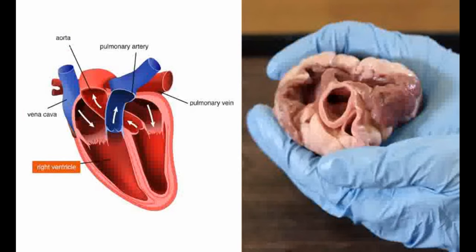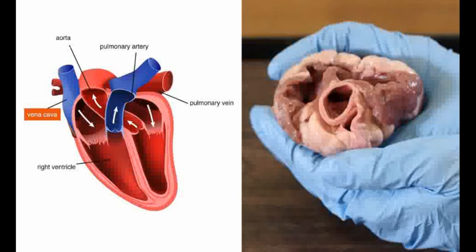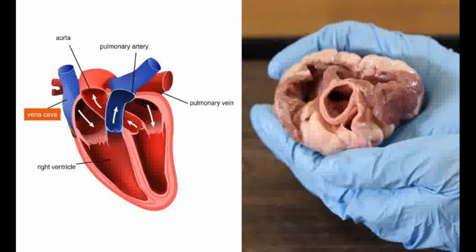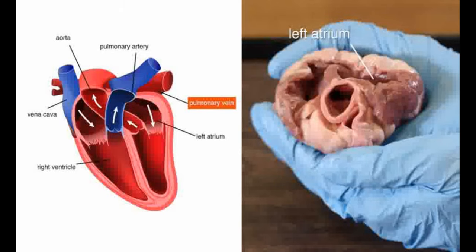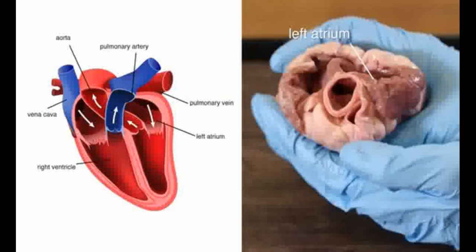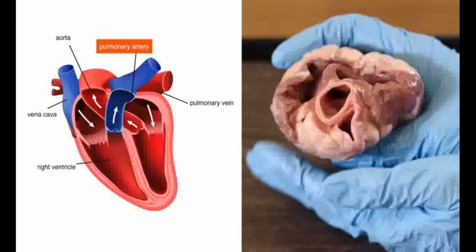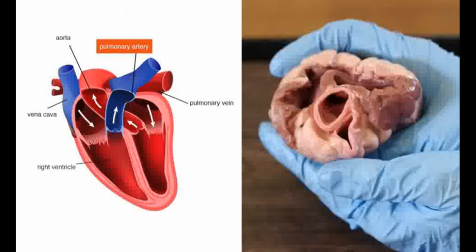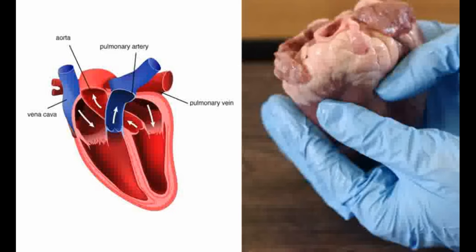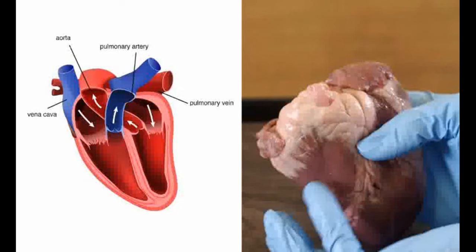Here you can see into the right ventricle. The vena cava has been removed. The vena cava is the biggest vein in the body. It brings blood back to the right atrium from the rest of the body. Its wall is thinner than the aorta as the blood moves at low pressure. The pulmonary vein has also been removed; this flows into the left atrium, bringing blood back to the heart from the lungs. This vessel is the pulmonary artery. Notice how this also has quite a thick wall, though not as thick as the aorta. This vessel carries deoxygenated blood from the right ventricle to the lungs.